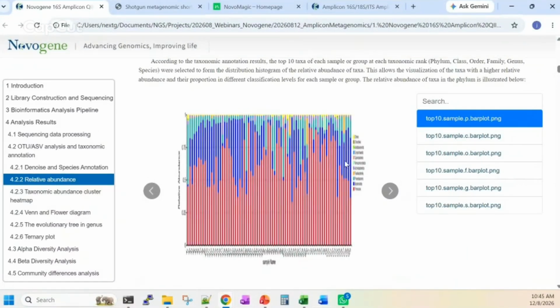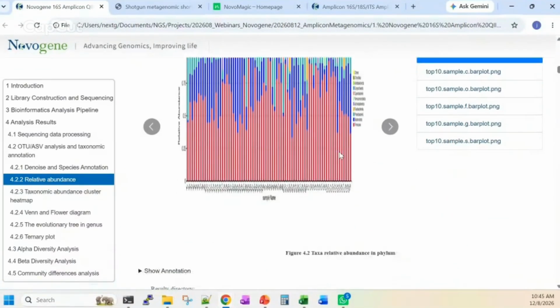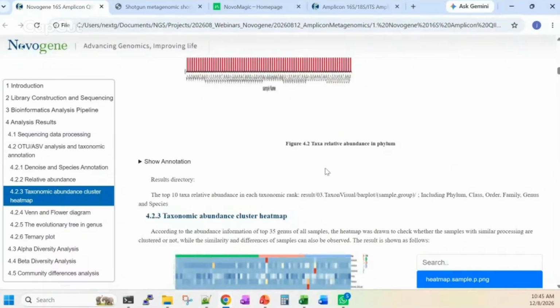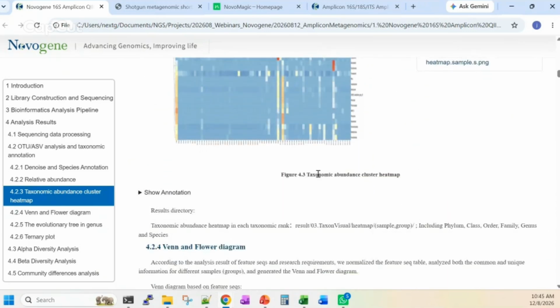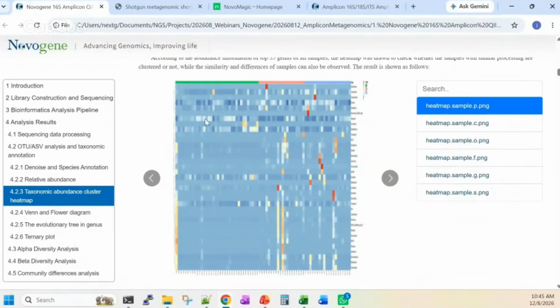So in the reports, when we have a lot of samples, the pictures might be a little bit running out of their original shape. So if you want to have the full high resolution pictures, normally each of these pictures that we are seeing in the report, the full or high resolution ones will also be provided in the project or results folder. And over here is just a quick overview of the sample contents, or the members of the microbial community inside the samples.